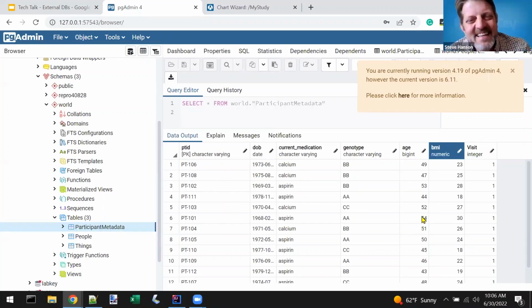All right. Thank you for that. Another question. Are all of the steps that you do in the demo documented in LabKey? If so, can you kindly share the link? We do have docs on, obviously, building the little resource tags, and we do have docs on getting through the wizard in the query browser.